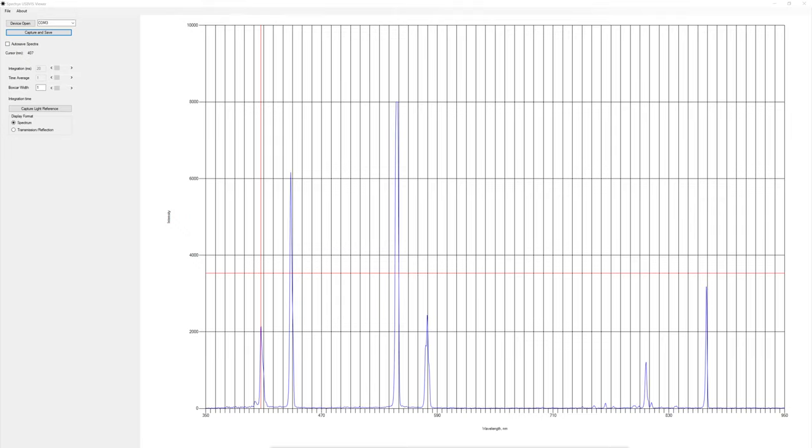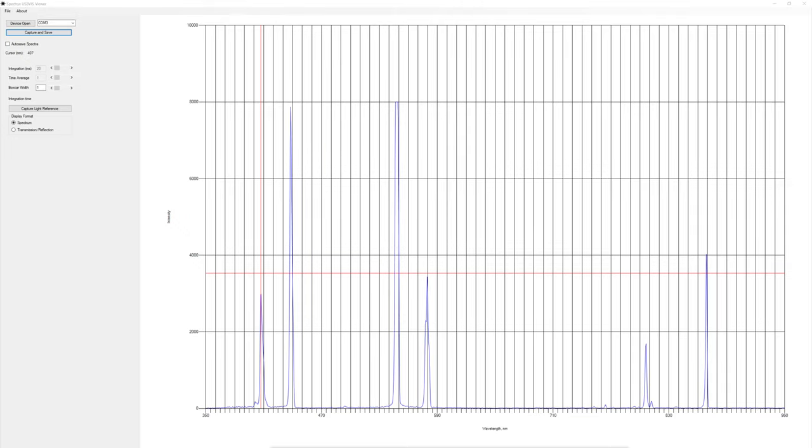And the lamp is warming up. I don't want to leave it on too long, so when it looks like it is settled enough, I think we will call it a day. Those are really tight lines.